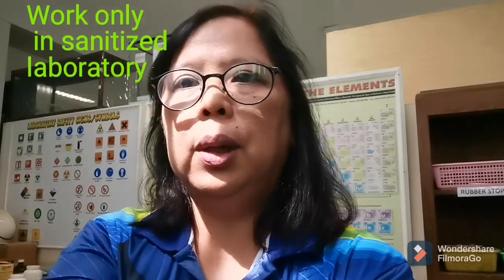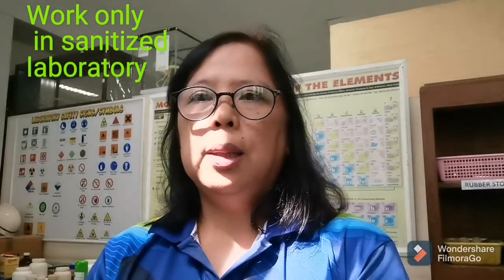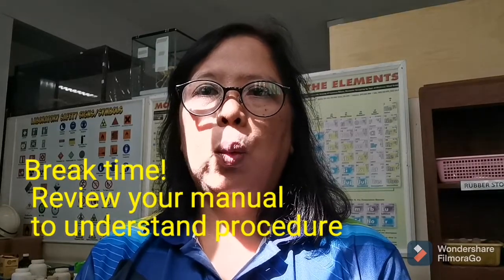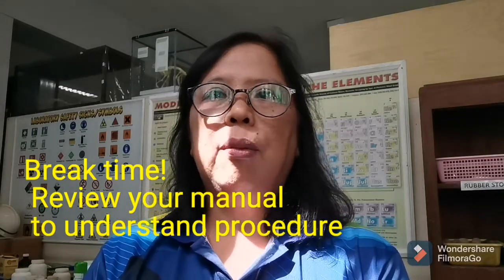I am at present in the laboratory office, and this area was sanitized, not only for COVID reasons, but as a protocol in the conduct of microbiology analysis. I would like you to pause for a while, and then go back and read your procedure before you come back and watch the video on the staining process, because the staining process will only take 5 minutes to perform.